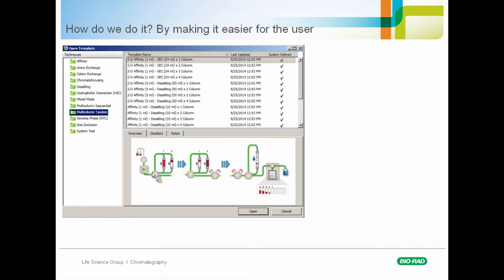And as I'm sure a lot of you who are familiar with doing affinity chromatography know, you can often load the sample in the forward flow, wash away the non-binding and non-specific proteins, but then if you elute in the reverse flow, it gives you a much more concentrated packet or band, if you like, of your target protein.